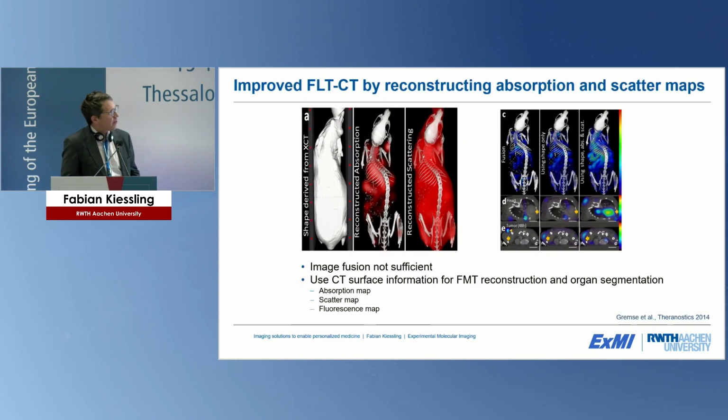First optical tomography systems just did that and assumed the mouse of being box-shaped, but this completely failed, because you need to really carefully consider the different surface properties of a mouse. You need to consider scattering, you need to consider absorption. And this really shows you how the impact of this information on data quality is.